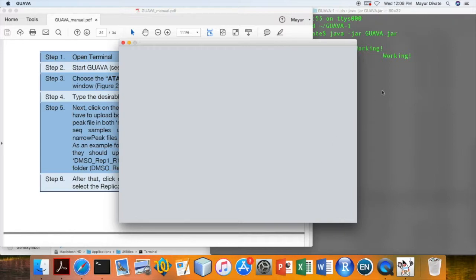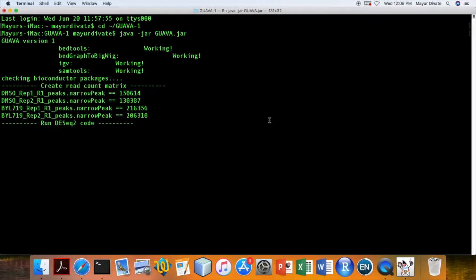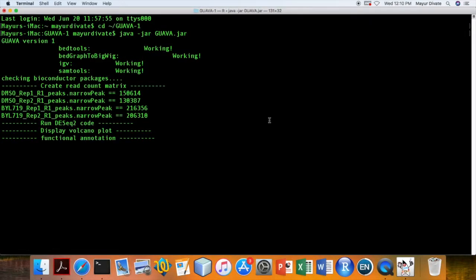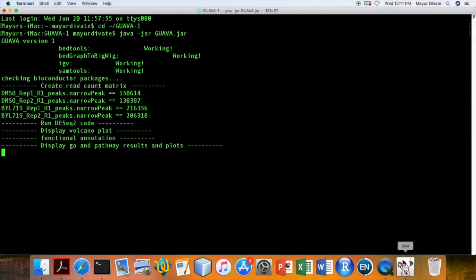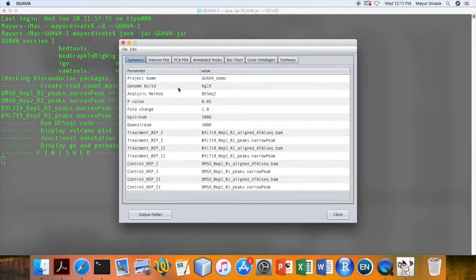This will take some time to finish. OK, it is finished now. We can browse the results.